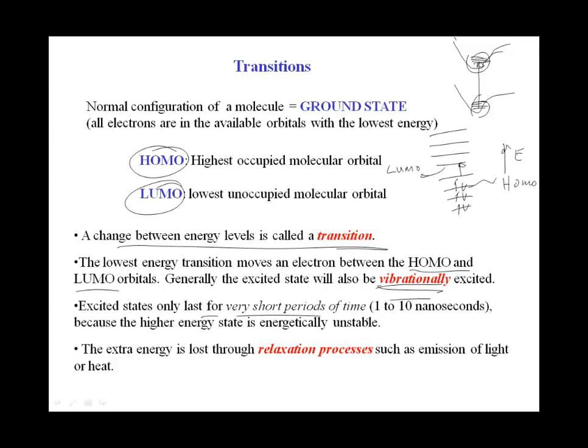Excited states are very short-lived. You cause the excitation, the UV visible light comes in, it causes the transition, and then it passes on. Of course, the molecule is then excited, so it will relax down to the ground state after that. There are various ways in which you can relax, such as various types of fluorescence, which we won't be covering.